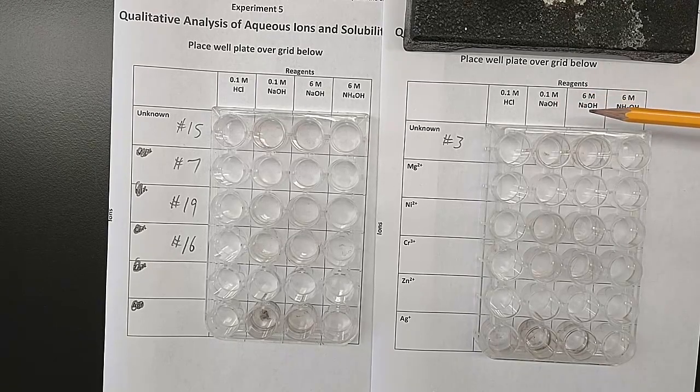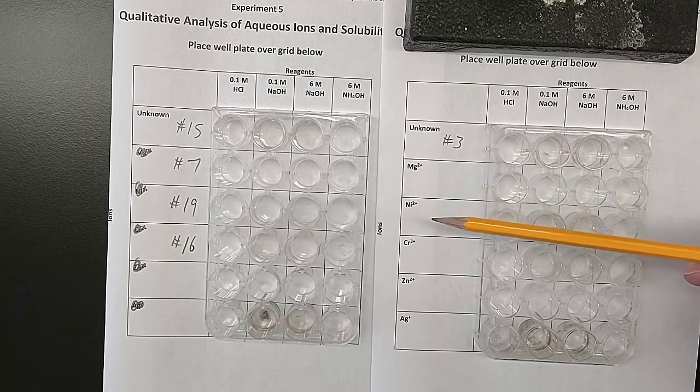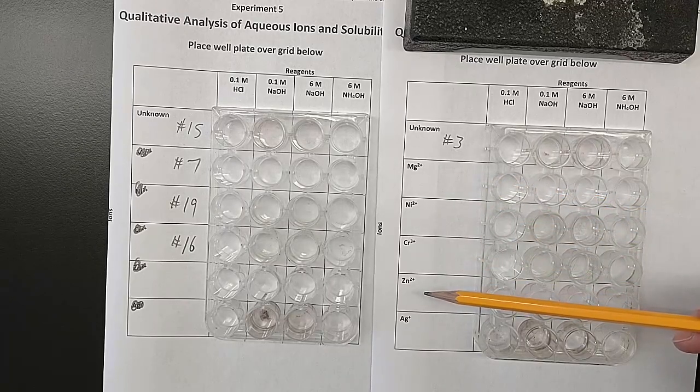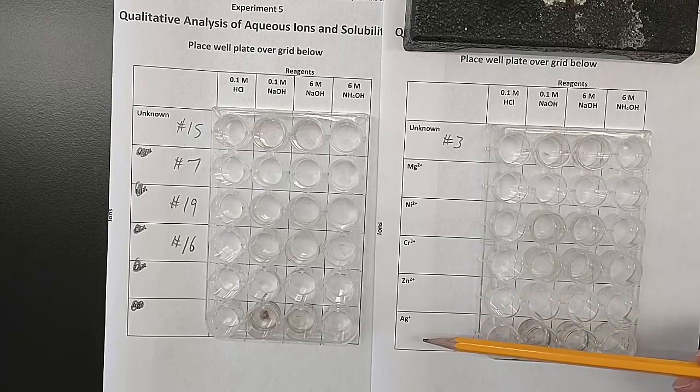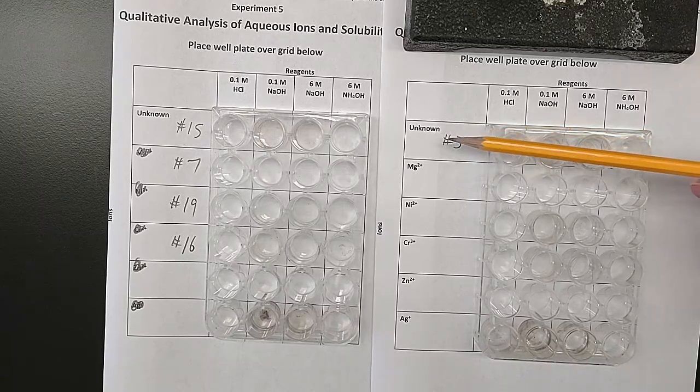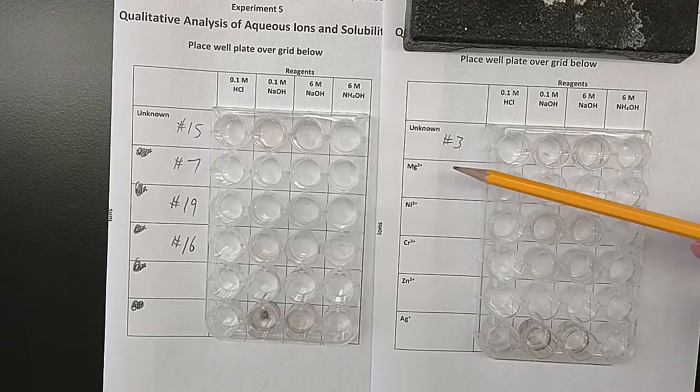But main group elements don't show that unusual behavior. They will behave the same, whether it's dilute or concentrated sodium hydroxide or ammonium hydroxide. And so having main group, transition element, different kind of behaving transition element and different kind of behaving transition element, we can see those different behaviors. And what we know is that our unknown is going to be one of these.